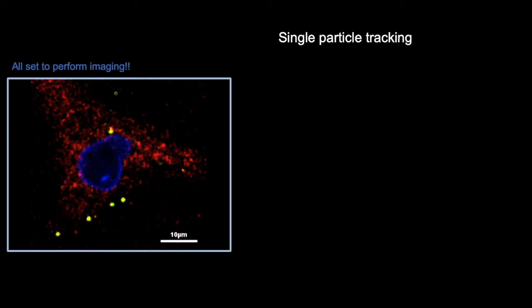So you can put the viruses on cells and acquire time-lapse images frequently, and then you will see the virus spots actually being over here. It won't play. It's okay. Yeah, so you would see spots like this inside your cells. The virus punctate will appear like spots.